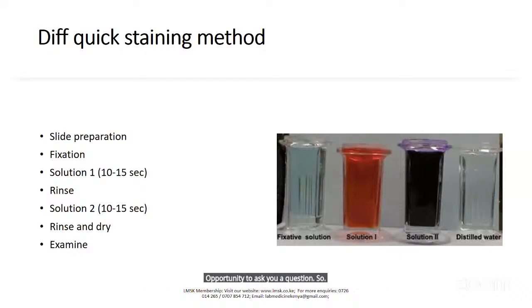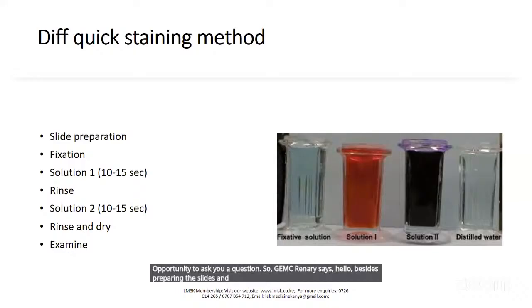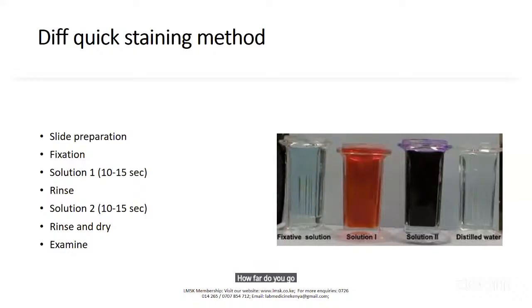James Ireri says, hello, besides preparing the slides and staining, how far do you go with reporting? With an MSc, can one make an interpretation? For cytology, yes. For histology, no. The training doesn't allow it. Sorry. That one you leave for the pathologist.